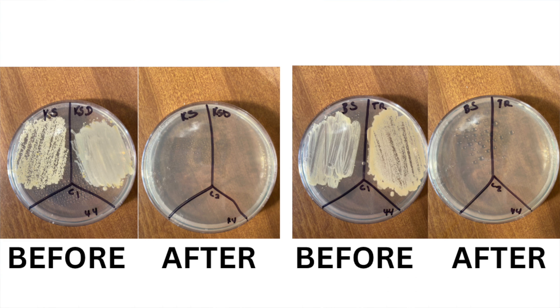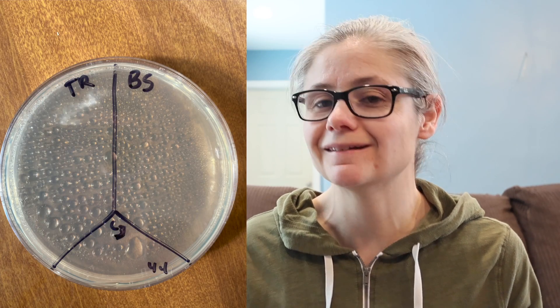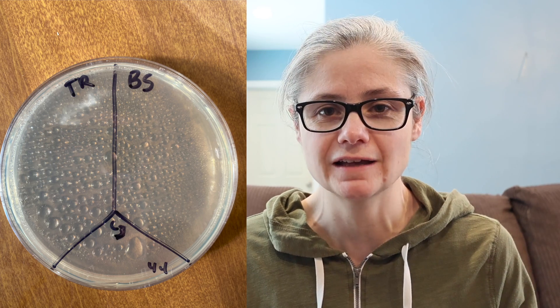Let's take a look at the side by side of before washing and after washing. Now let's look at after the cloths came out of the dryer — the kitchen sink and the kitchen sink drain. I could not find any bacterial colonies at all in this petri dish, so all of the bacteria was removed from that cleaning cloth. In the toilet rim and the bathroom sink, again, all the bacteria is removed from the cleaning cloth. So that's fantastic.